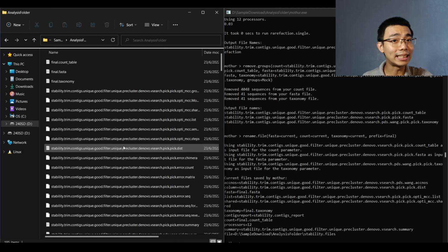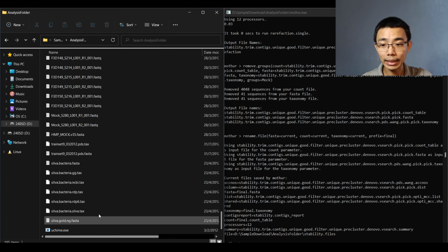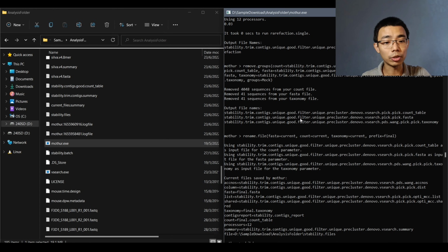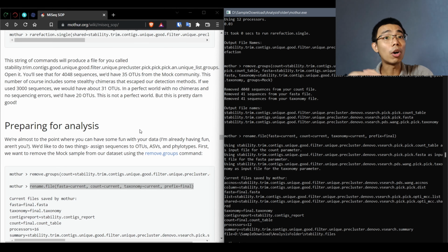We unzipped them into an analysis folder, and then went to mothur.exe, the interactive mode of our mothur software, and went through the individual steps: getting the FASTQ, making the contigs, trimming off all the edges and overhang, aligning them to a reference, classifying them based on the training set, and in the end checking with the mock FASTQ information whether we have done it correctly. That is all the cleaning we need to do before we get to these 3 files.